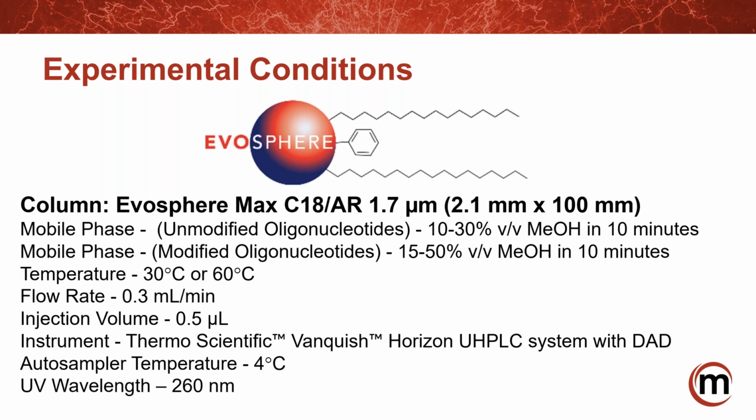Normally with the existing ion pairs, they're not easily getting one base pair change. So they have to use mass spec for mass monitoring to know what's present in the validated method. But the power here is we're getting one base pair change on the oligonucleotide.